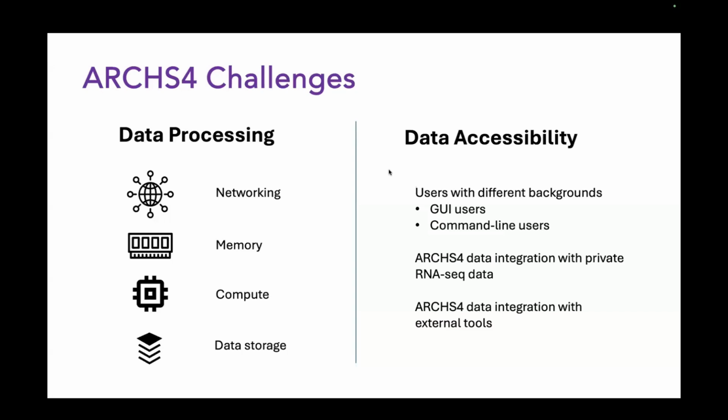And then the problem of sequence alignment is that it requires a lot of memory, a lot of compute, and you have to deal with flexible storage. So designing the pipeline, we really had to focus on those components, and we kind of got it right at the beginning in 2018 with cloud infrastructure.